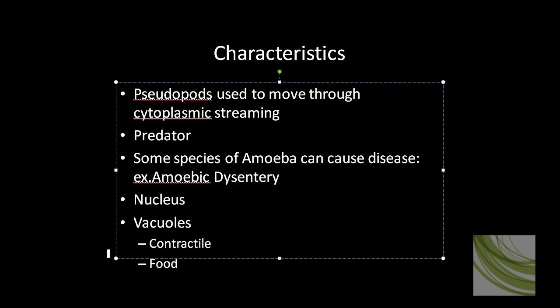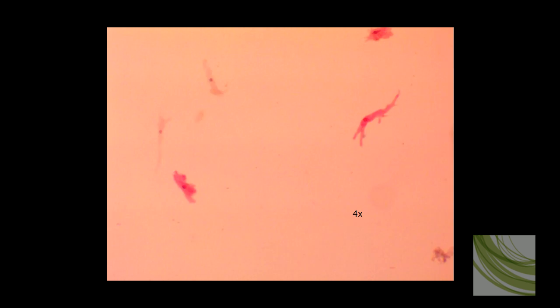You can look at an amoeba and tell it by things like its nucleus, vacuoles—you'll see both contractile and food vacuoles—and you will see the pseudopods. We're going to look at three different slides we have here at the college.